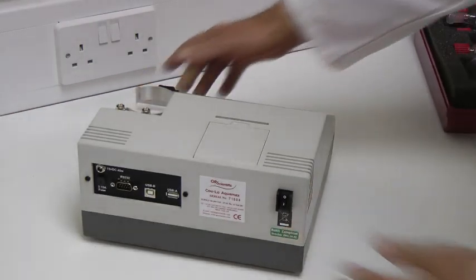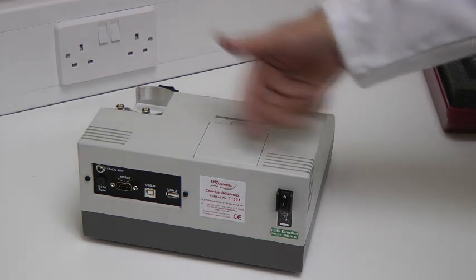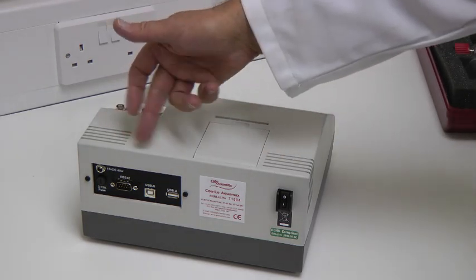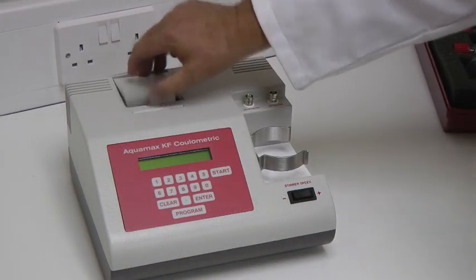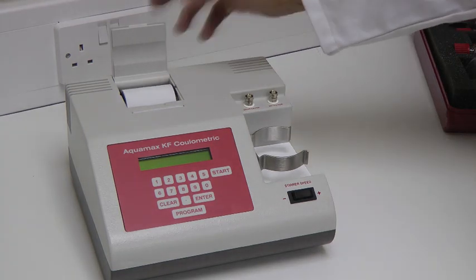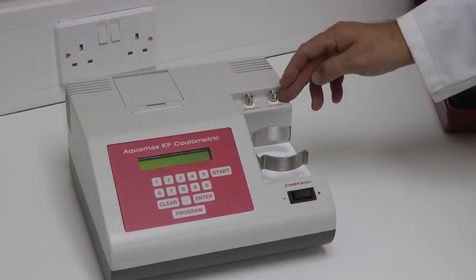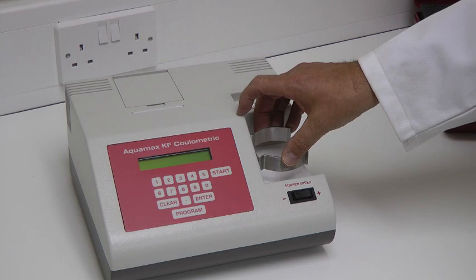At the rear of the unit are the power switch, the power inlet, the fuses and the RS232 and USB connections. At the top and front are the printer, connections for the electrodes, the titration vessel holder, and the front panel.